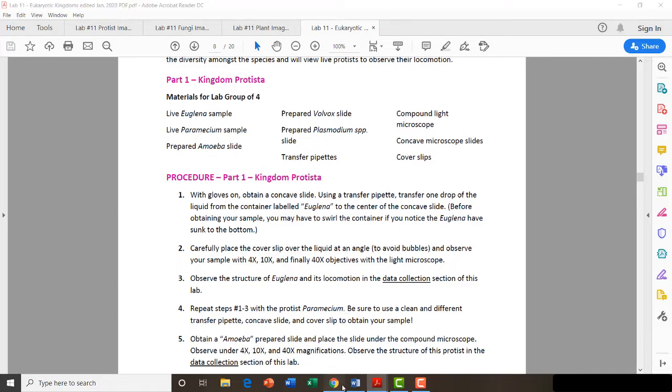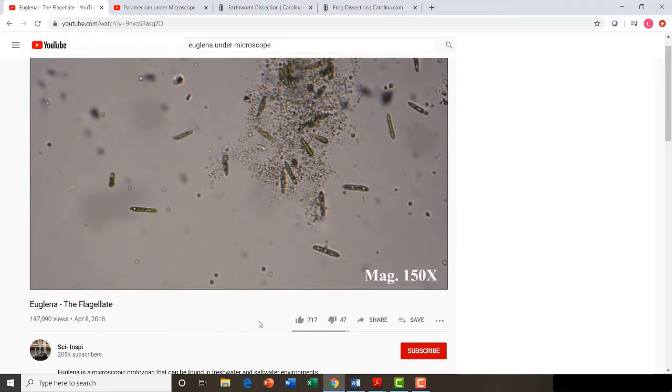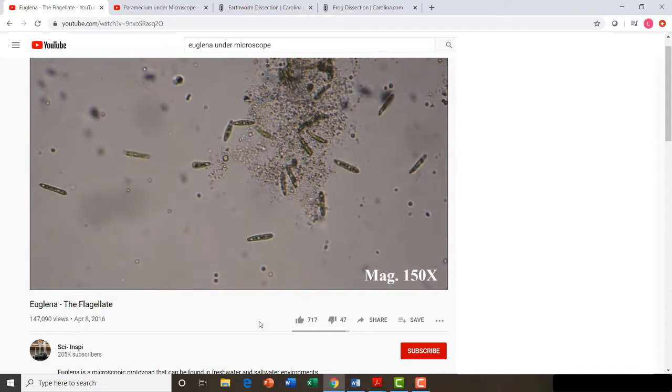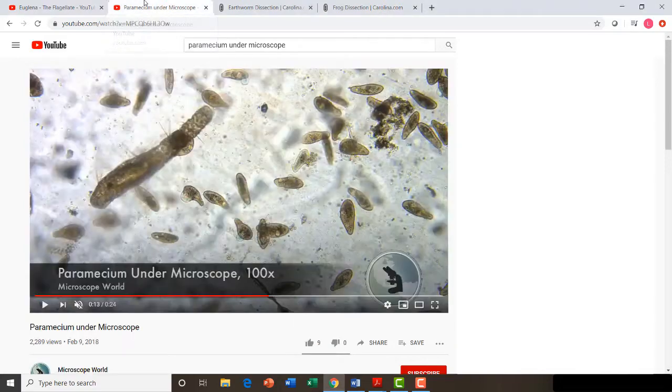So what I did was found some videos. So here's Euglena. And what I really want you to just know is how the Euglena is moving, its locomotion. So I'm going to just play a little bit of this video and just take a minute to see how the Euglena are moving, what they're doing. Okay, and next are the Paramecium.